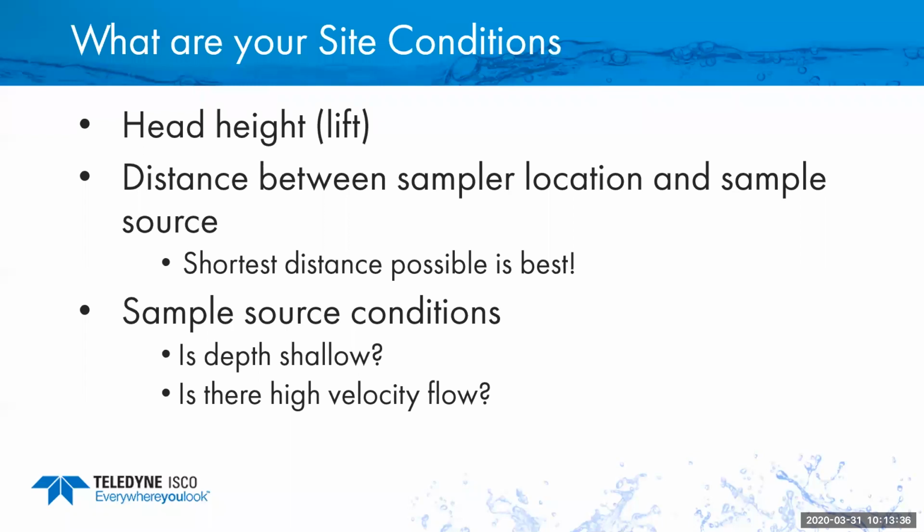I've seen people tie it to a cement block and throw it into a river, channel, or stream. Basically, they put it on top of the cement block, which keeps it above the bottom of the channel so you don't get sediment. But if you're looking for the sediment, then you put it down closer to the sediment. It's really dependent on your site, your conditions, and what you're sampling from. So you definitely want to keep the strainer in place.